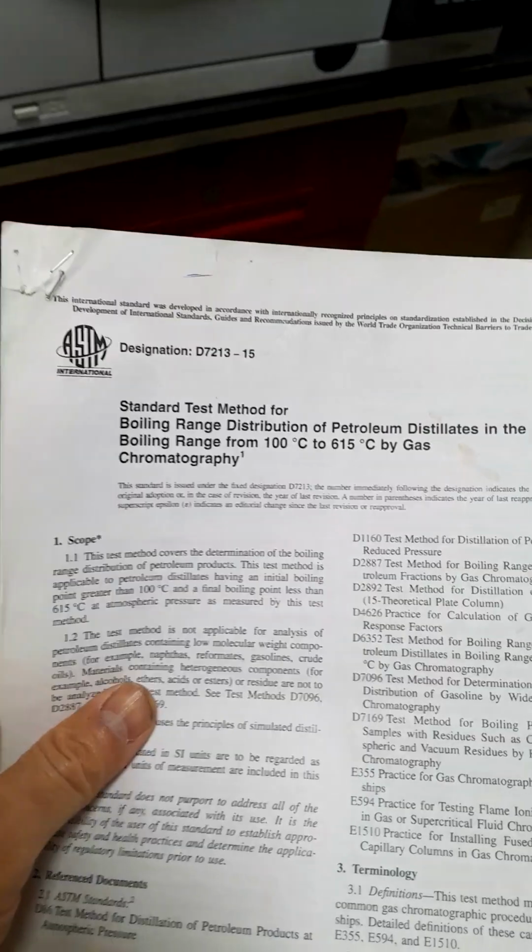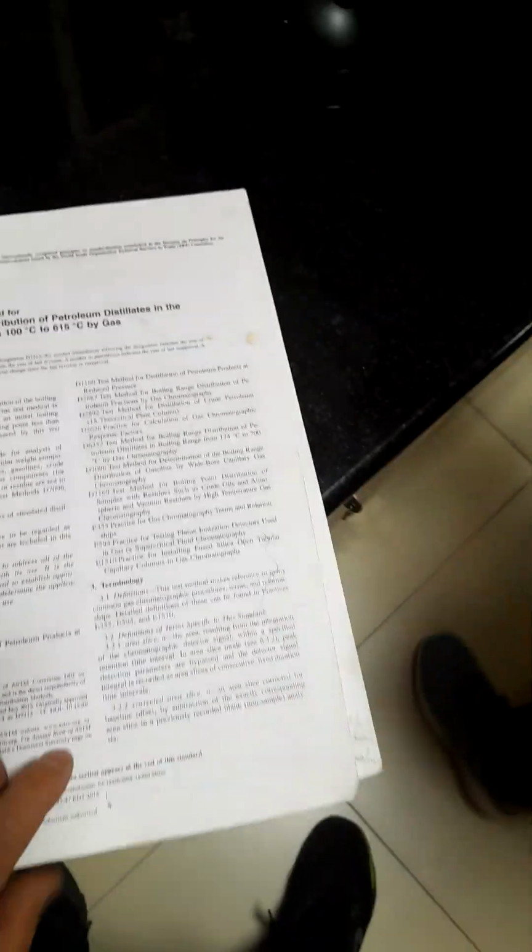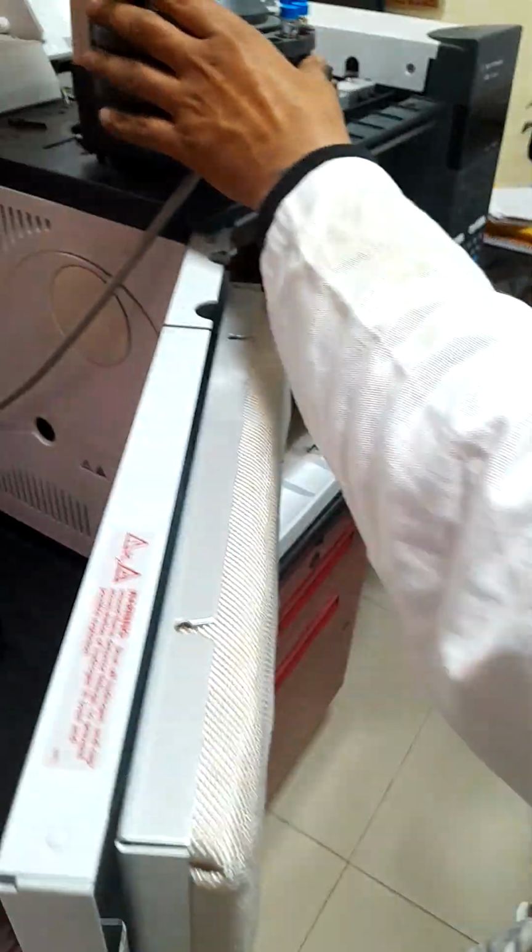Because many of you have seen or heard or learned what a GC is, but some of you may not be aware of the basic parts, how the GC looks, how the column looks. Some have studied but some have not seen, and it's my duty to show you how the GC and column look. Okay, so this is our auto sampler.